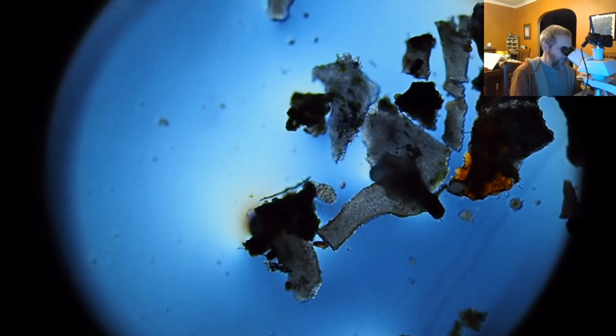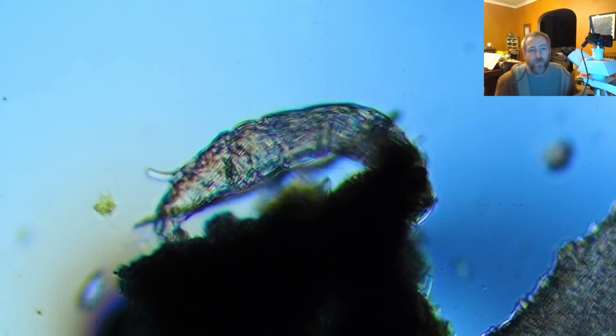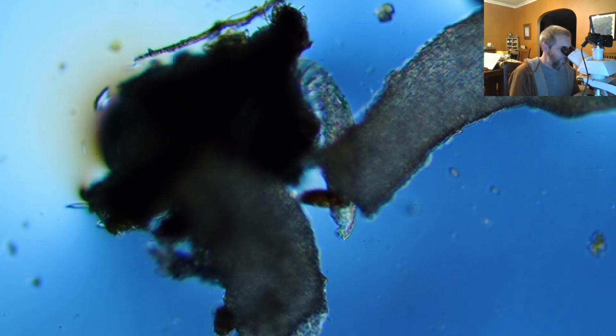Oh, you can see that one had its little corona out and was spinning for a bit. Little rotifer. I feel like maybe they need to be one click out, like that, so we could actually see them without them constantly being off of the screen.